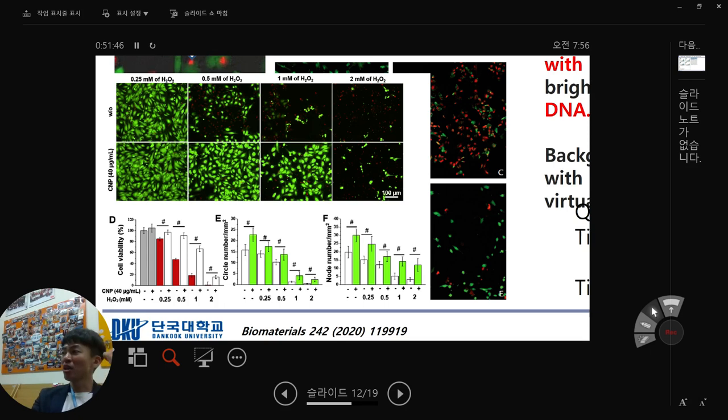But if you are short of time, what will you do? I suggest live and dead, not CCK. Only one well is okay, live and dead. But CCK needs at least 5 or 6 in number, right? Live and dead, just one well, two wells is okay. They can represent your result.